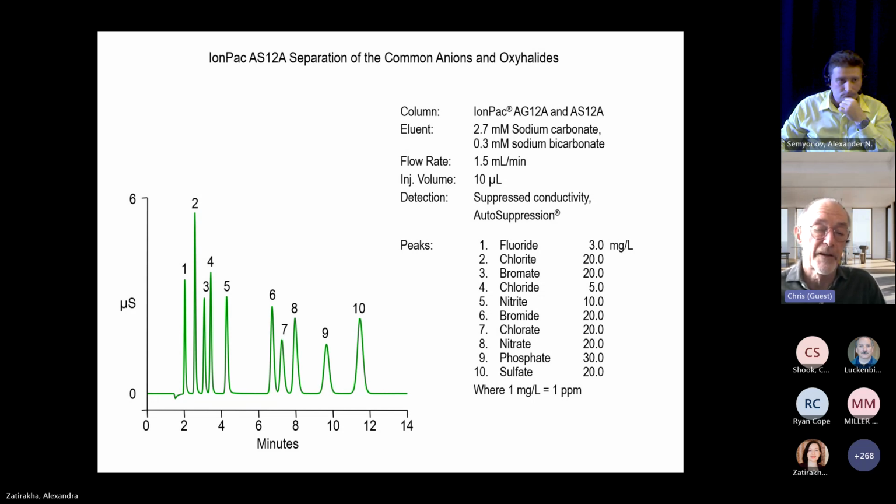And the reason for using a large pore size is that this phase is surface sulfonated and then coated on the inside and the outside surface with latex. And doing that, even though it constrains the size of the latex, allows you to get about 5 to 8 times higher capacity than you could get from a non-porous resin with latex on the surface.